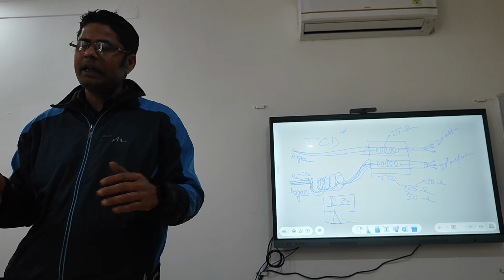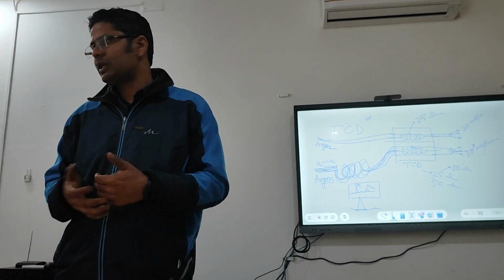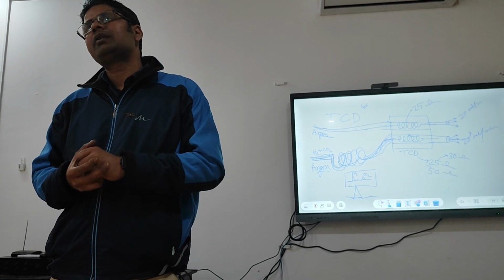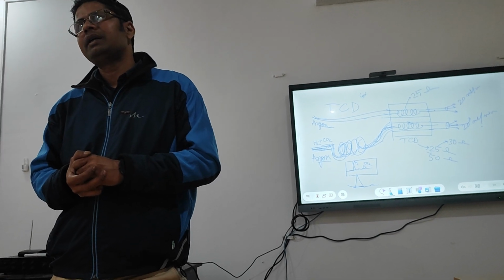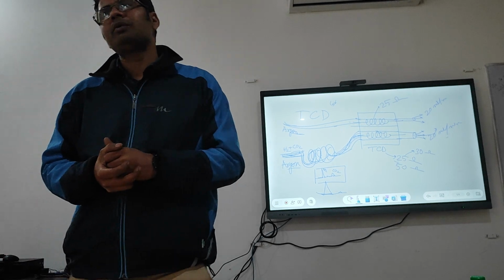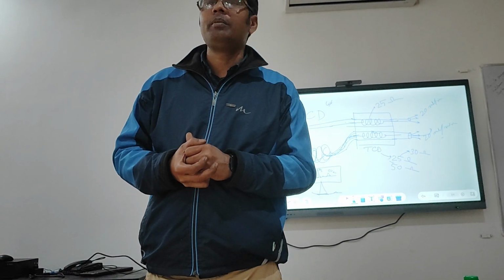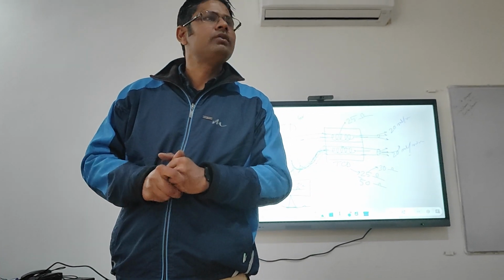But if you are injecting a mixture with some hydrocarbons and non-hydrocarbons also, which detector should be used? TCD, so that all the components can be detected. If you are using only FID, only hydrocarbons will be detected, and your analysis will not be complete. So you got your answer, ma'am? Yes.